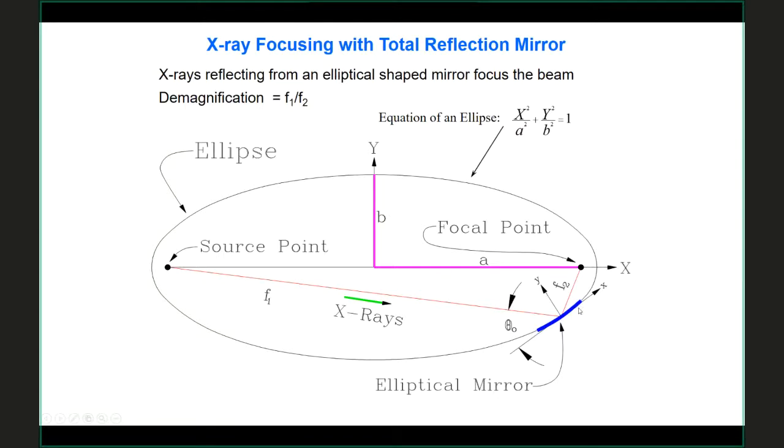Today, what we're doing is we're actually bending the mirror the wrong way. So instead of bending it to be a concave shape here, we're bending it to be a convex shape, at which point it blows the beam up and makes it bigger on the sample than it would have otherwise been.